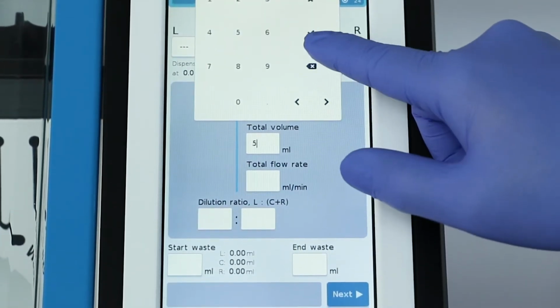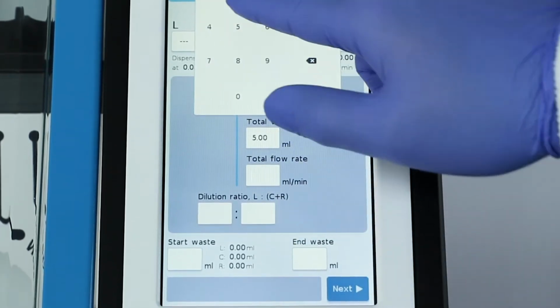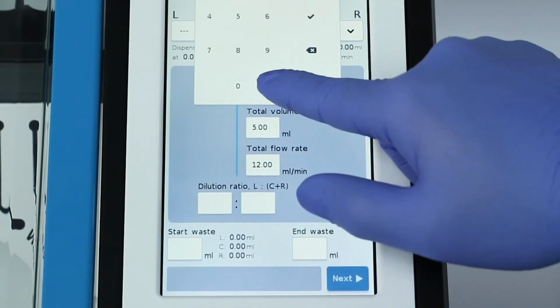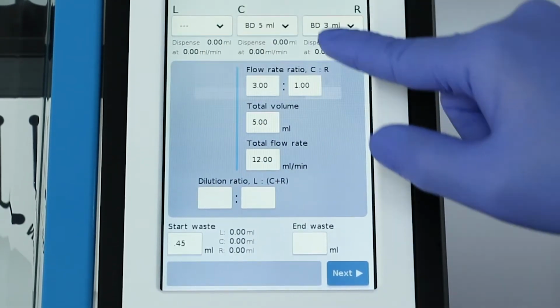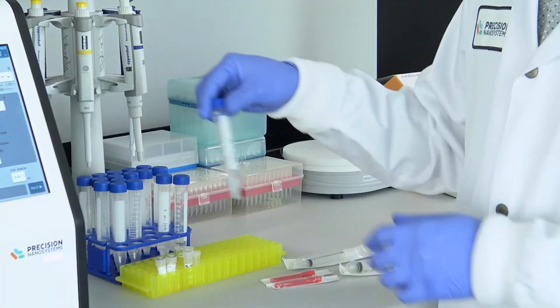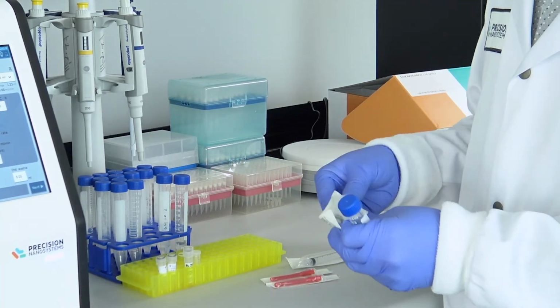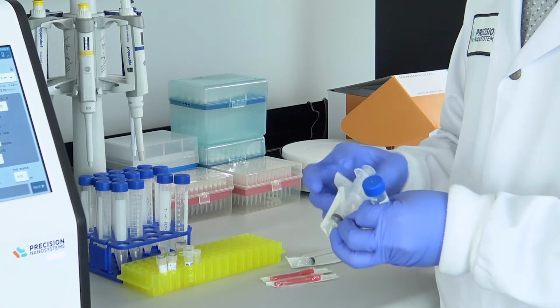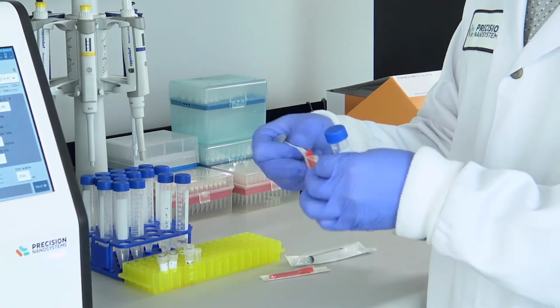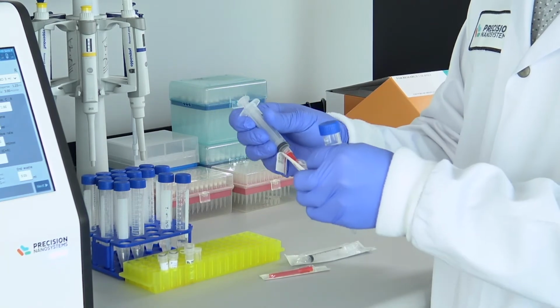The Ignite's interface puts key parameters that define the conditions of particle formation, such as the total flow rate and the flow rate ratio, literally at your fingertips. It ensures that conditions are highly reproducible, run after run, regardless of who's using it. With Ignite, NxGen has been scaled down and engineered into a format appropriate for preclinical development work.